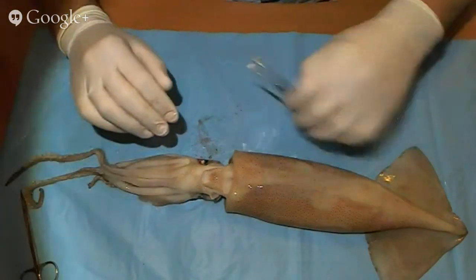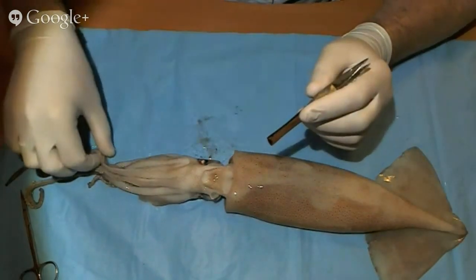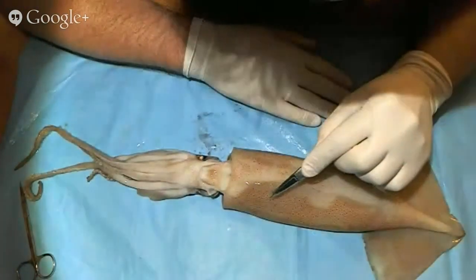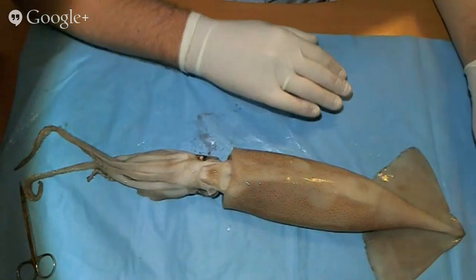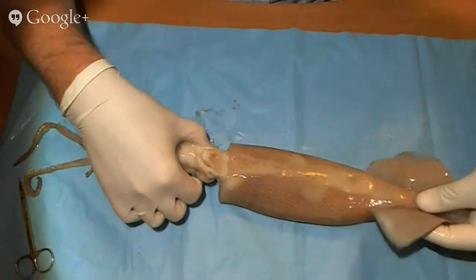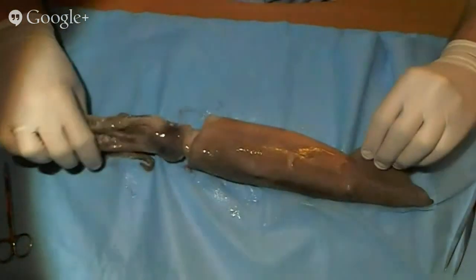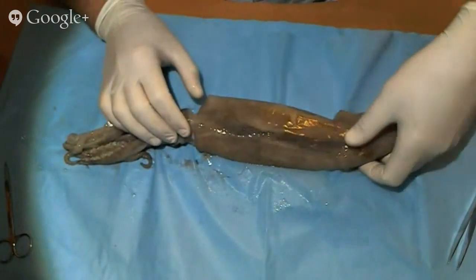All right, so in pointing out some of those basic features, kids will immediately say, if you ask, well, what do we see on the outside of this? They might say, oh, look at all the little spots. And you can ask, well, what is that for? Why would they have spots? And what's the difference between the spots that are on this side and the spots that are on this side? So they might tell you that, oh, look, over here on this side, this is darker.